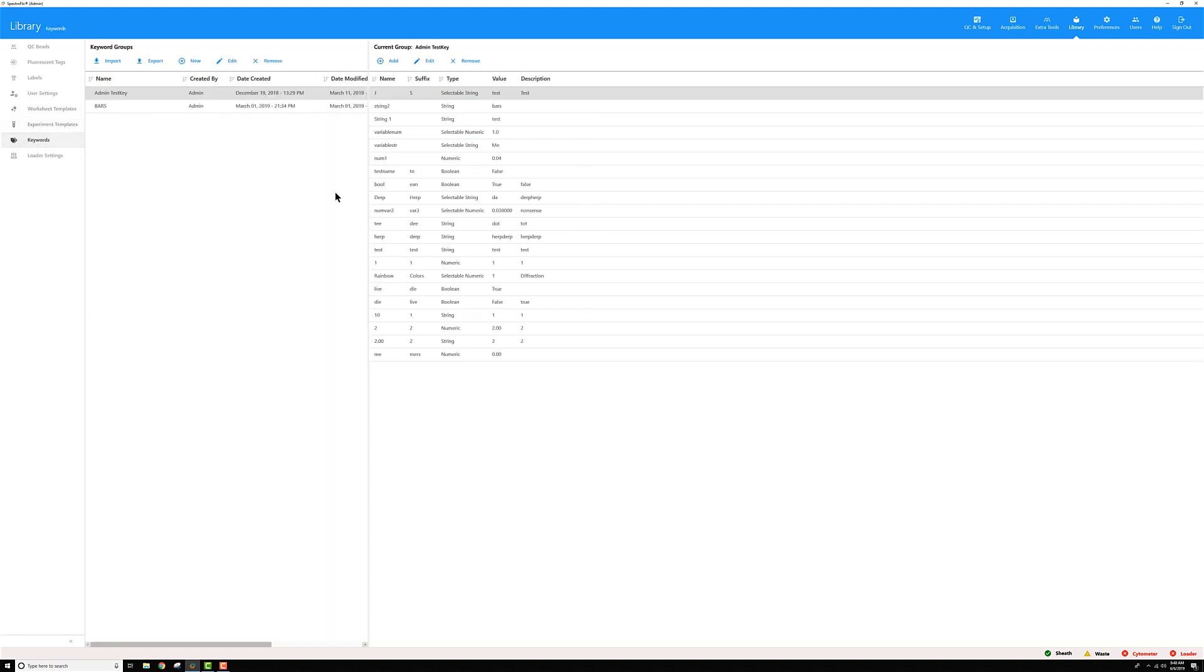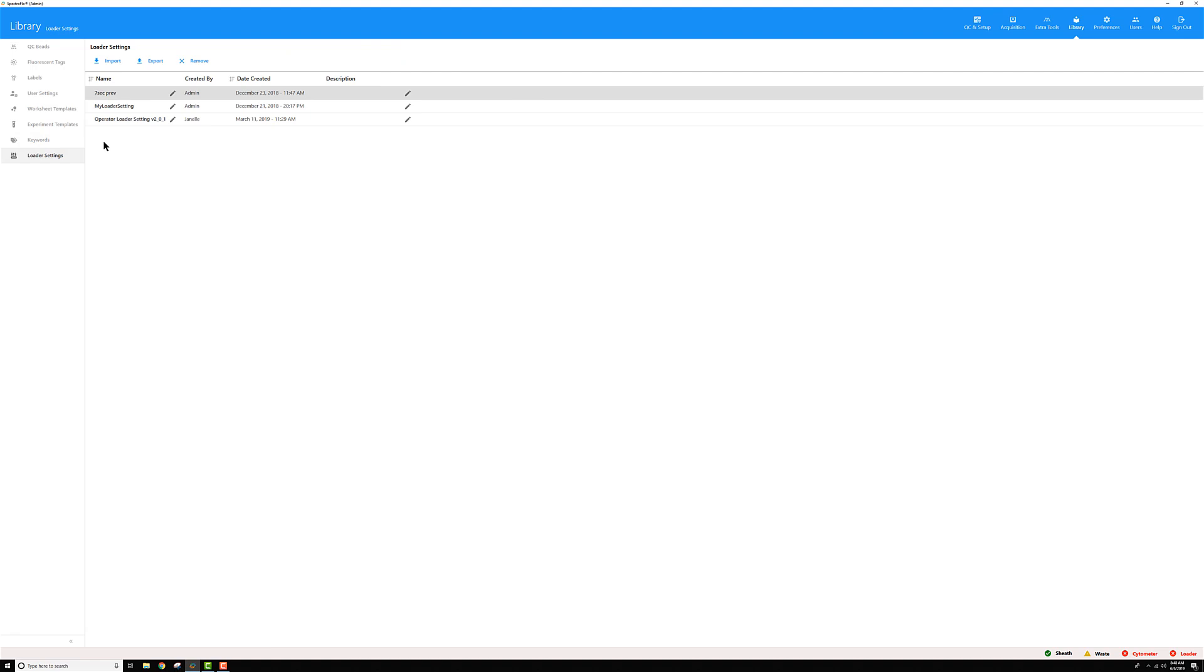You can generate your own keyword lists and customize those. We'll talk more about that in other tutorials. And if you have a loader on your system, you can create custom loader settings and import and export those across your instruments.